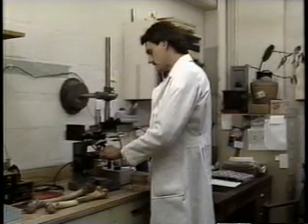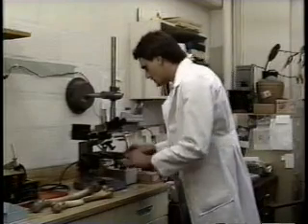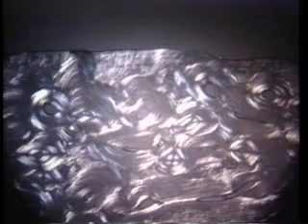If we go to the next slide, which is an individual in the mid-40s, you can see a change in frequency of structures. At this age, you're getting a higher frequency of bone remodeling structures. By bone remodeling structures, I'm talking about the osteons, and actually the osteon fragments. These are simply osteons that have been eaten through by newer osteons.